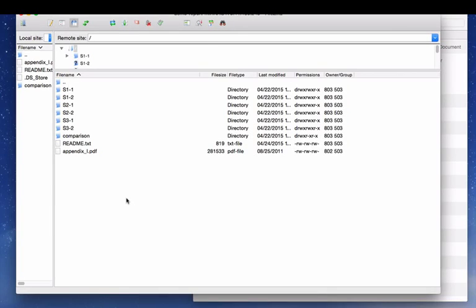Hi, this is Christoph, and I will give you a quick walkthrough through the microRNA sequencing data that you received from us. You will find them either on a DVD, or if the experiment had a larger number of samples, they will be on a flash drive that is included with the report. And of course, you always have the option to download them from our FTP server.